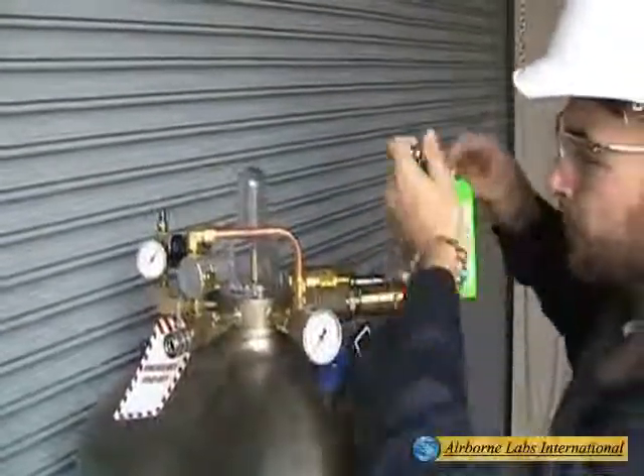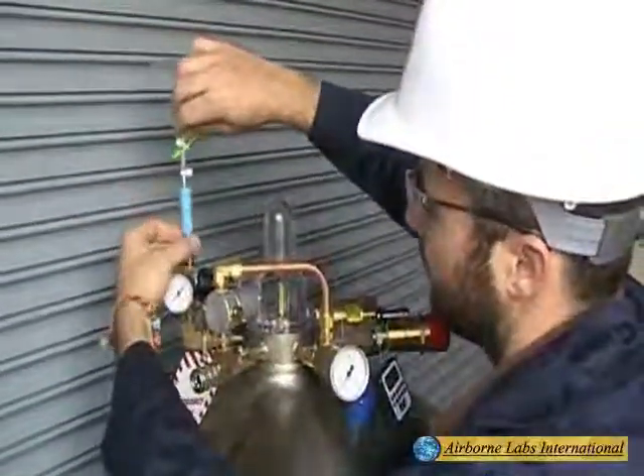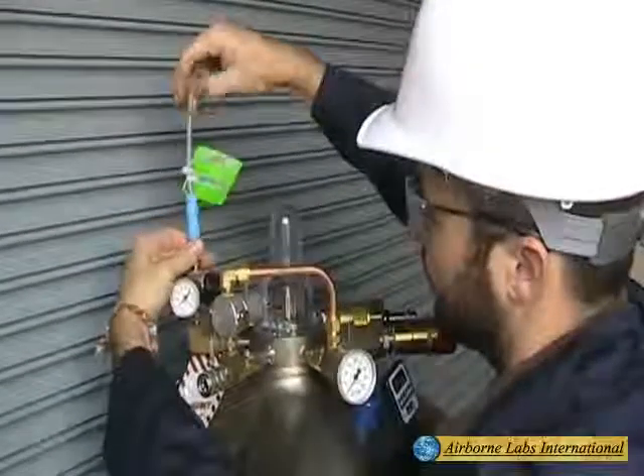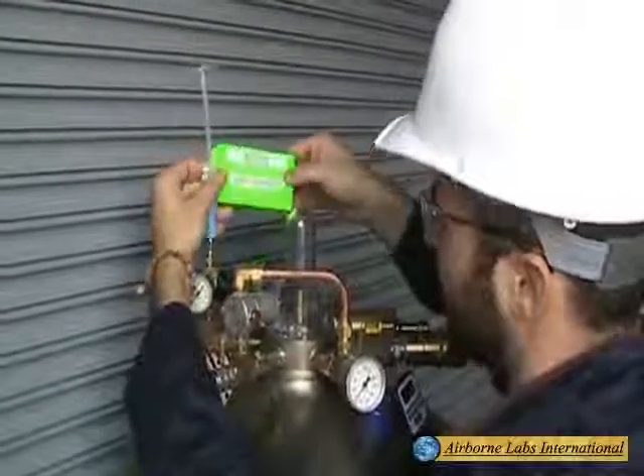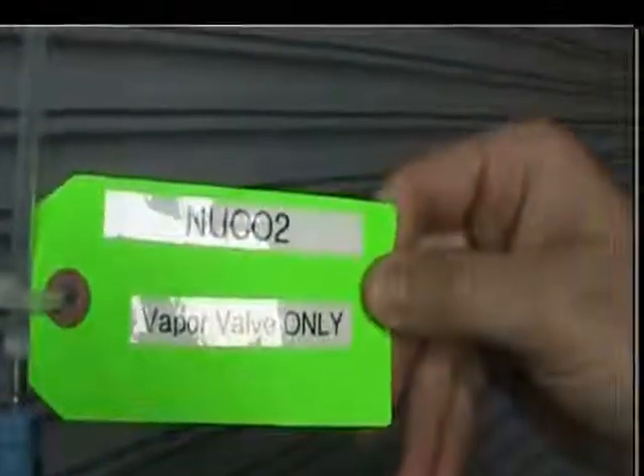Vapor Phase Sampling is sometimes required. When needed, disconnect any existing outlet tubing and then connect the Vapor Phase Only T-Fitting Assembly to the Vapor Port's Flare Fitting.